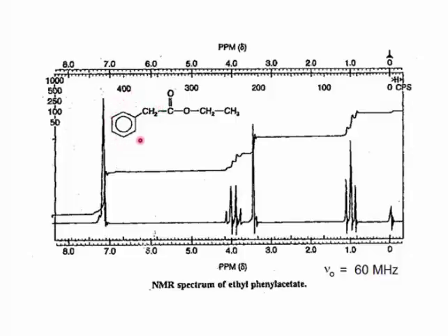And now we come to the ring hydrogens, the benzene ring hydrogens. Technically, the hydrogens on the ring are not equivalent because you have ortho, meta, para. They're not the same. However, when you have an alkyl group attached to the benzene ring, they're very close. We say they are approximately equivalent. You can see the difference between them if you use a higher field instrument, like a 300 or 400 megahertz instrument. But using this lower field instrument, these benzene ring hydrogens are not going to be that different. So we'll regard all of them as a single set of 5 equivalent or approximately equivalent protons.